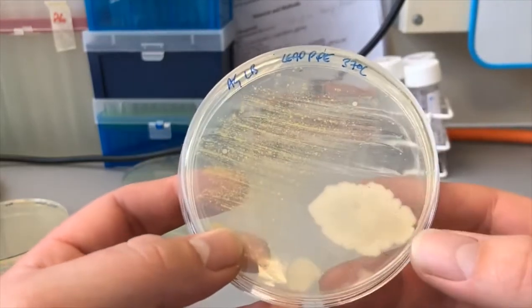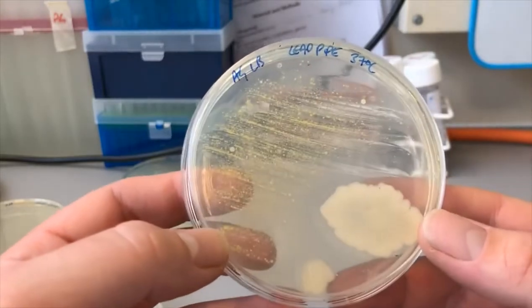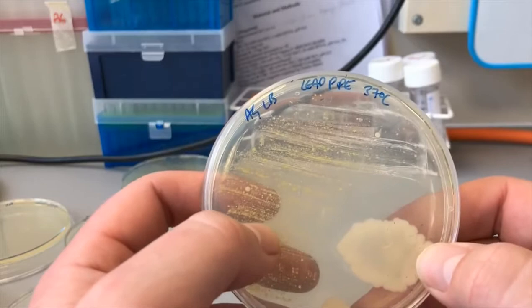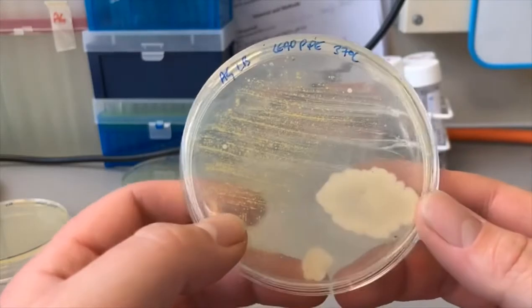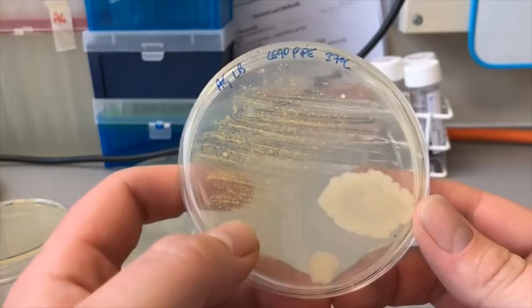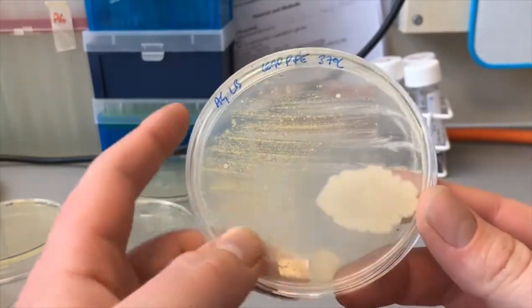If I get the chance, I'd like to do some identification on these and find out what is actually in there, because we've definitely got two distinct different colonies. It'd be interesting to find out whether any of them are resistant or anything like that. We'll come back in about five days and see if anything else has grown.